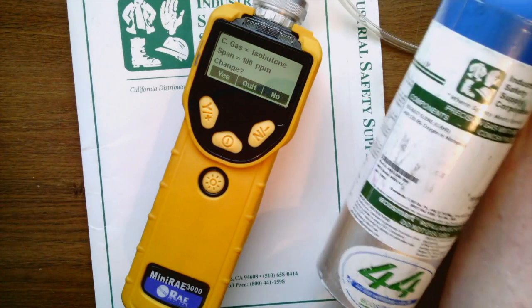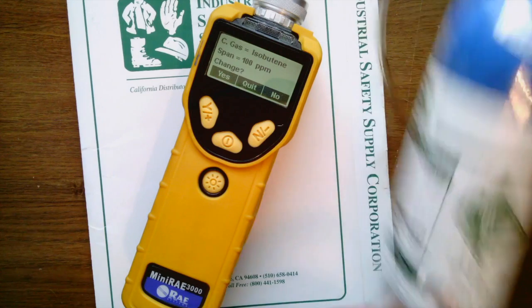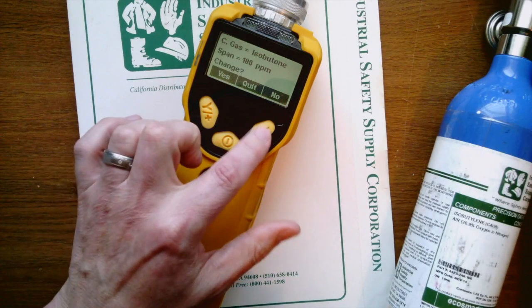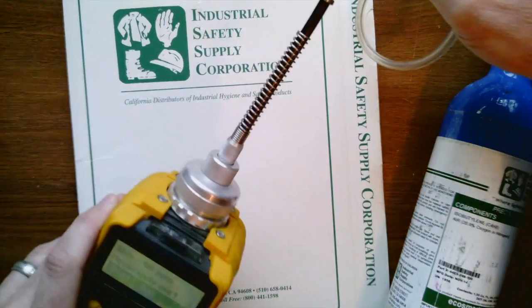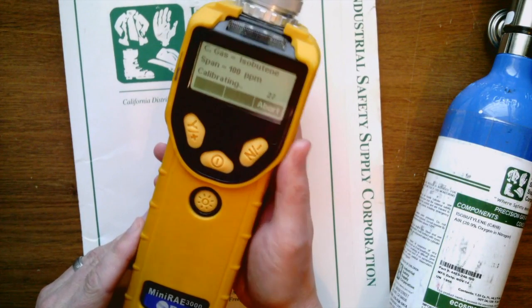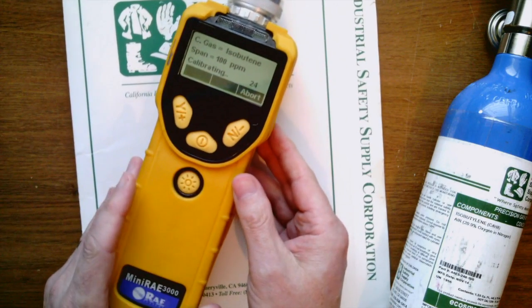I'll show you really quick here — isobutylene 100 ppm. Let's lay this down here and I'm going to hit no because we do not want to change it. Then it's going to ask us to apply this gas, so I'm going to go ahead and put the span gas on. It's recognizing it and running through a quick 30-second countdown for the calibration.